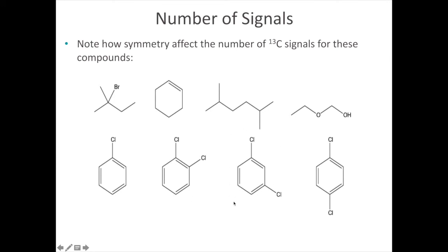How about this one here? If you see the line of symmetry is here. So this is 1 atom, 2, 3, also 4. How about this one? You see there's this line of symmetry and also this line of symmetry, right?